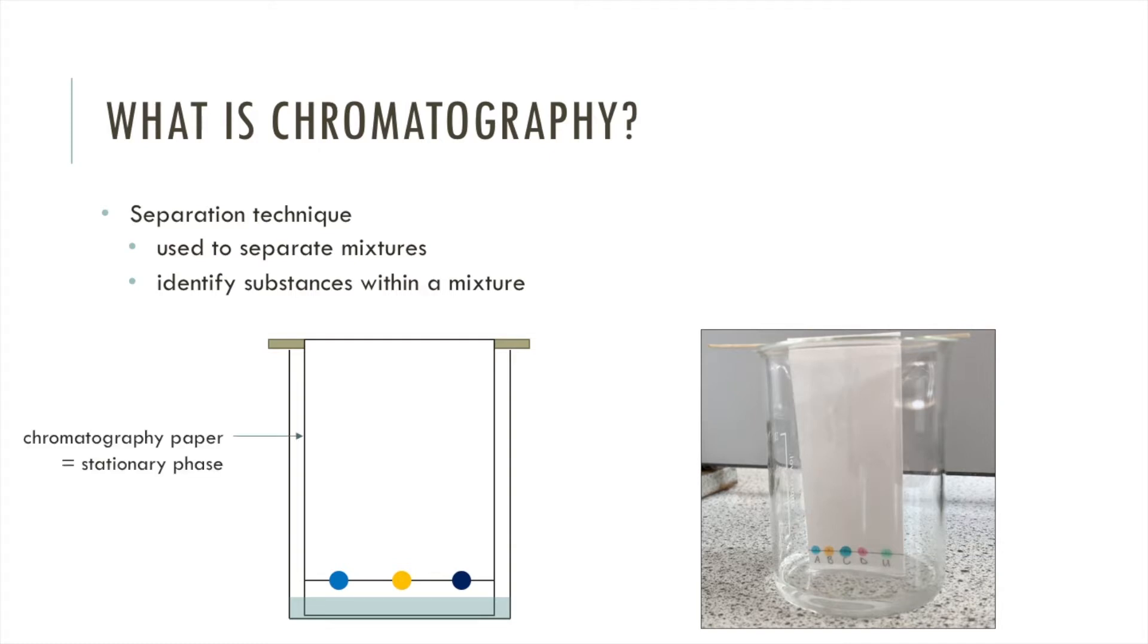Here is our chromatography paper and we call that the stationary phase because it doesn't move. Here is the solvent and this is our mobile phase because it does move and in fact it's going to flow through this stationary phase.